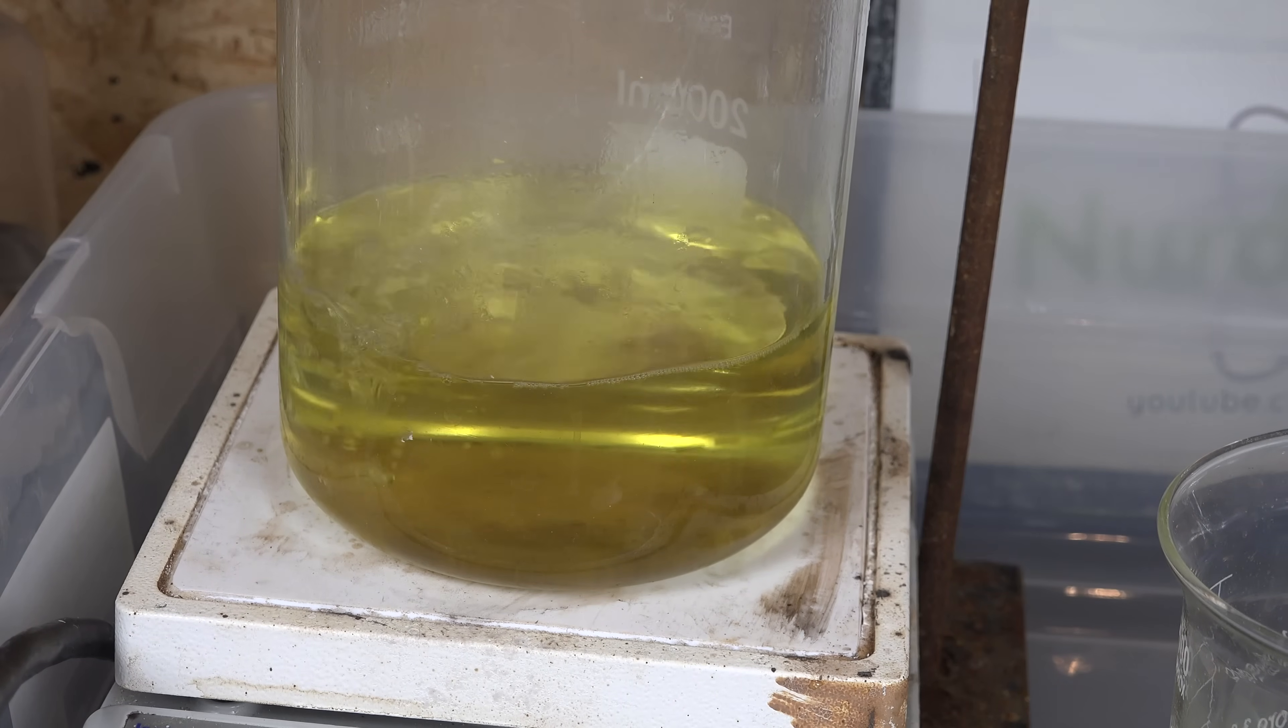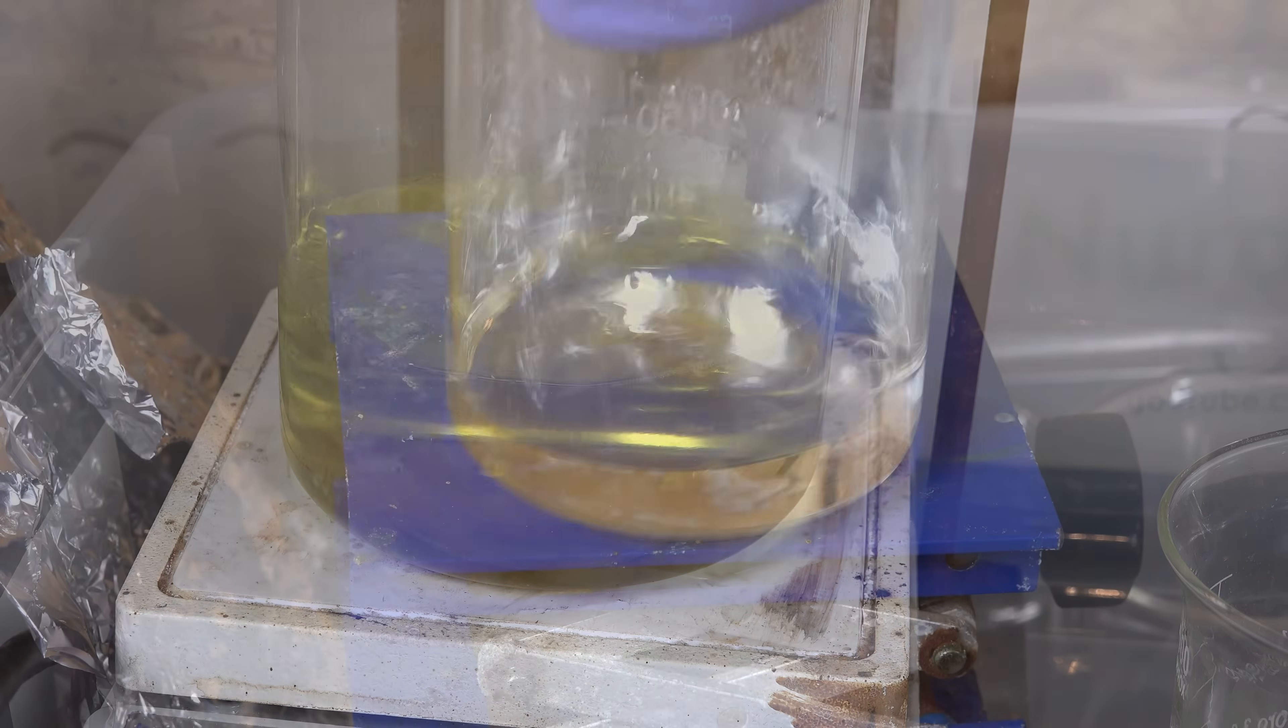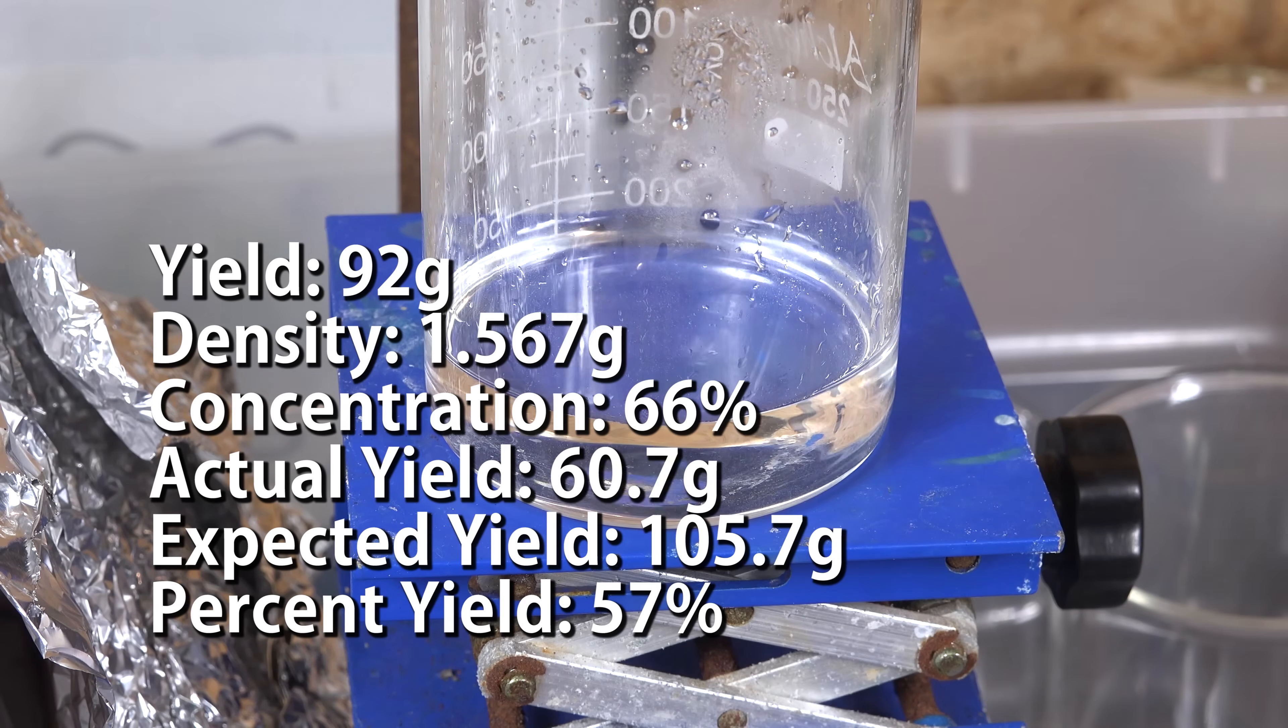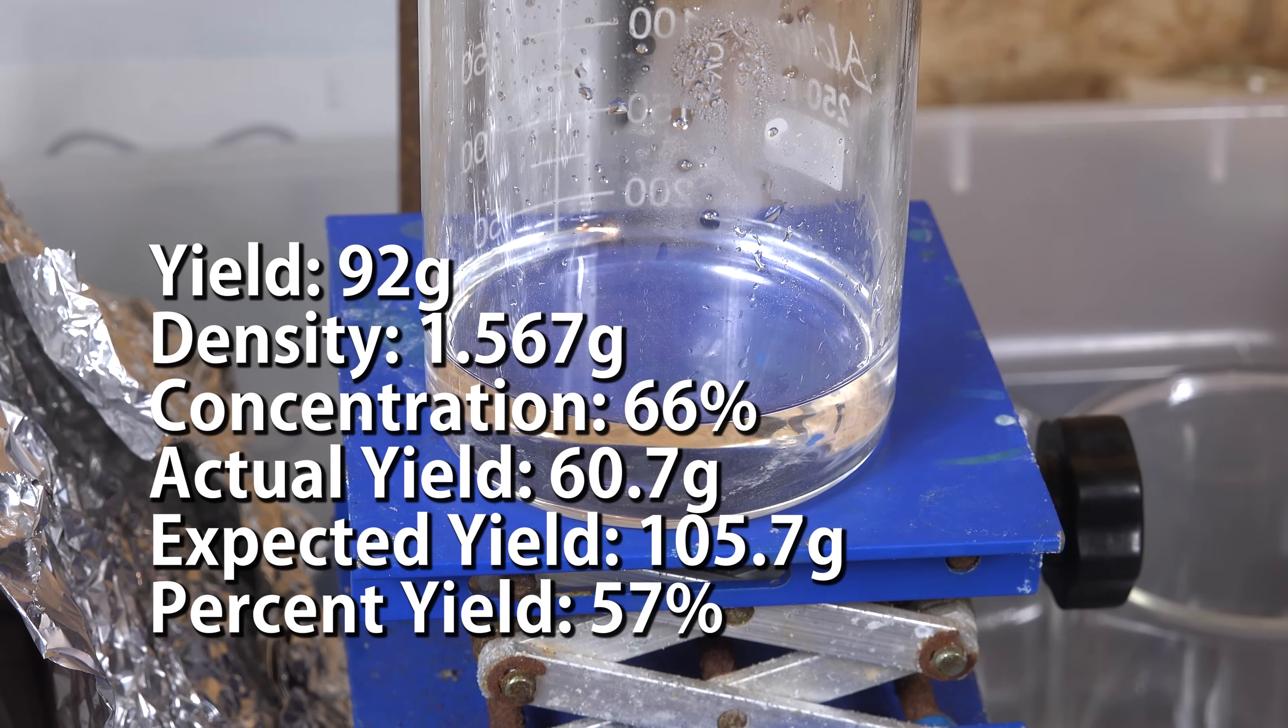And after doing the subsequent distilling and filtering, I was able to get about 57% yield of sulfuric acid with the displayed parameters. So this process can be optimized.